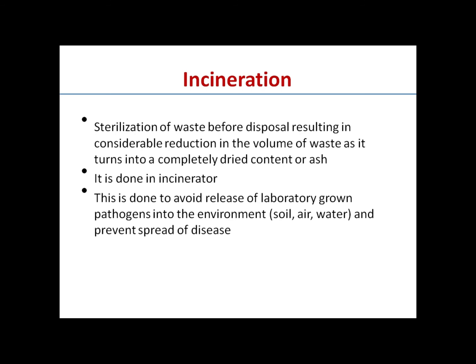So, after a microbe or a pathogen is worked with, it should be disposed of well. The media where the microbes grew should be incinerated so that the microbes get killed, and then the waste, which is reduced in content because of incineration, should be thrown in the dustbin. This should be followed to reduce the spread of microorganisms in the environment.